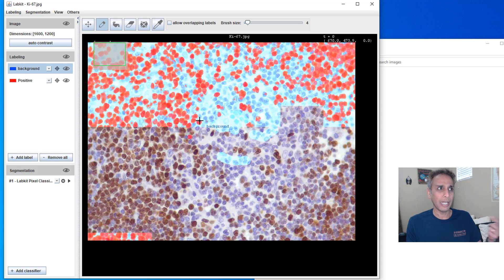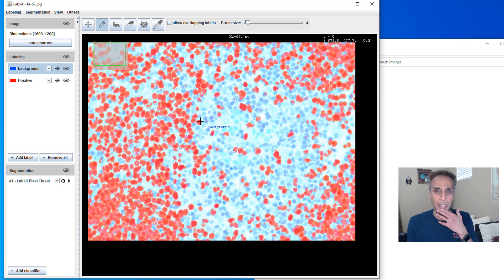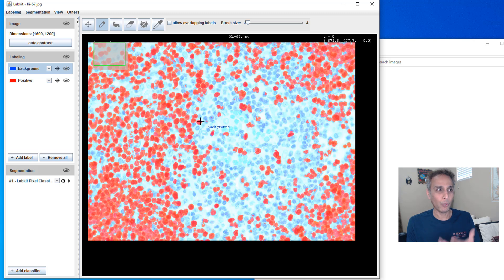And it is training the image based on the few labels that I just provided and then segments this image. Well, I started the discussion by talking about image labeling, but why am I talking about training?